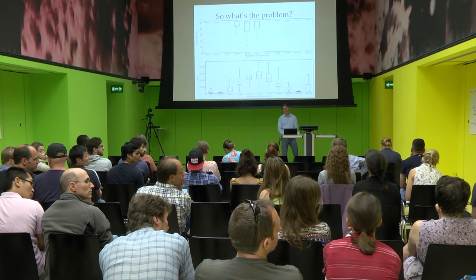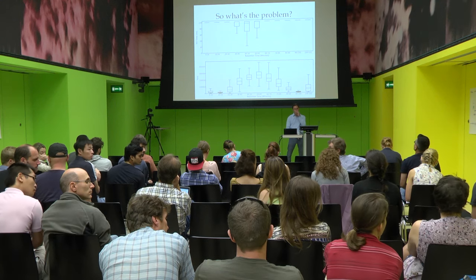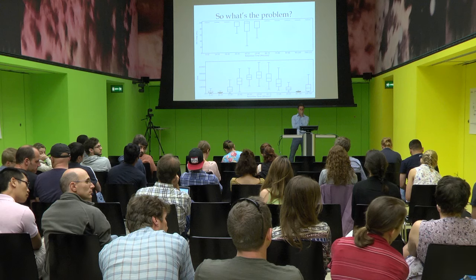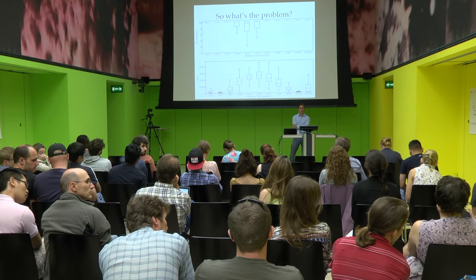I think it's hopefully going to revive the MSX approach, especially if I can make the demultiplexing faster, because it's pretty slow right now. Yeah, so my question is regarding peak sampling frequency, because as I understand, you pick the windows randomly, right? Yeah. So then it means that the frequency of sampling per MS range is now not constant anymore, right? Yes, that's right.